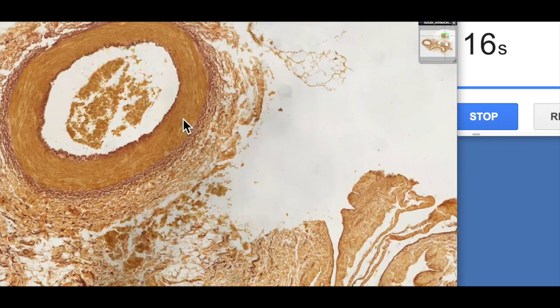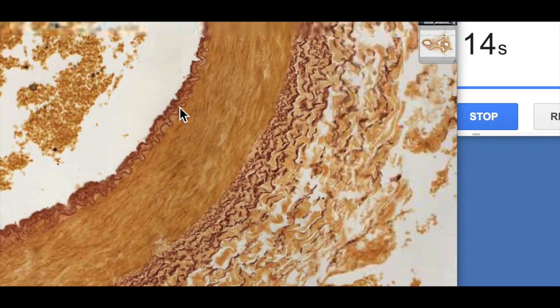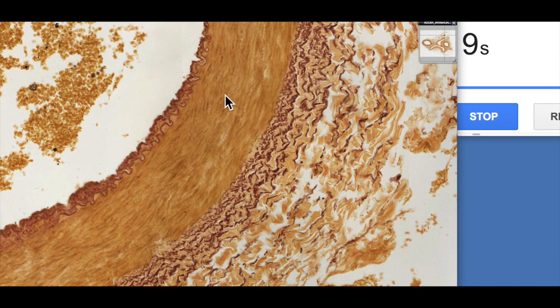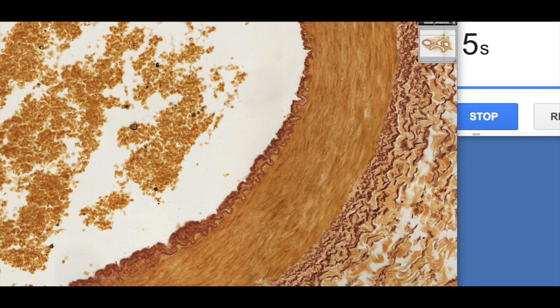Again, we've got our little muscular artery with our really nicely defined internal elastic lamellae. Here's our thick muscular wall of our muscular artery and our adventitia. And of course, we've got some blood cells there.